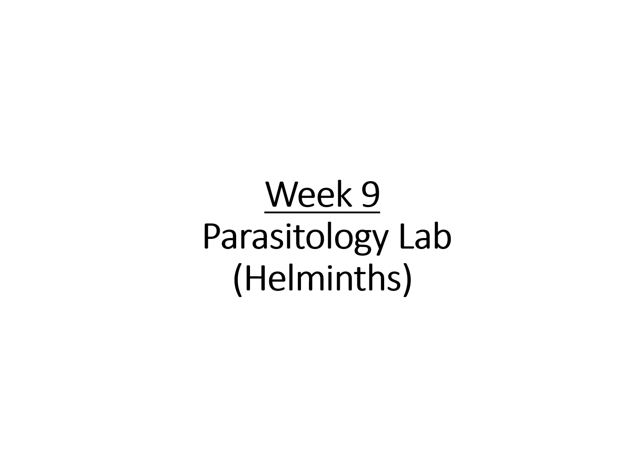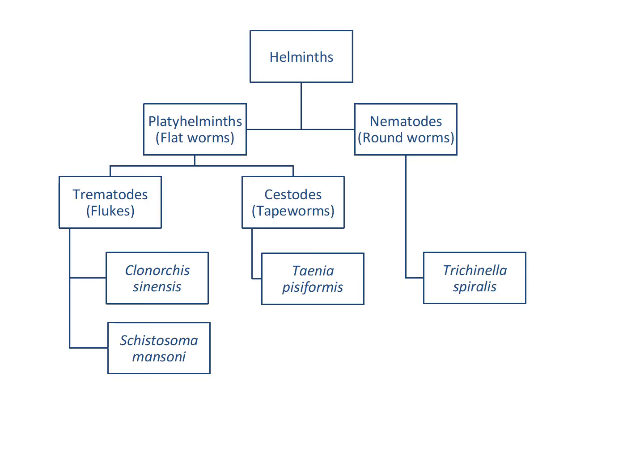We move on to another group, and those are the helminths, and those are basically the worms. So when we talk about worms or helminths, there are two main groups that we discuss, the flat ones, the flatworms and the roundworms. The flatworms are the platyhelminths, the round are the nematodes. And those are basically examples, right? So this is an example of the nematode.